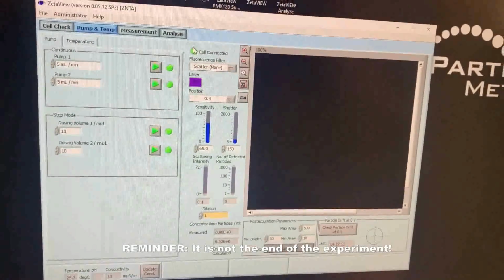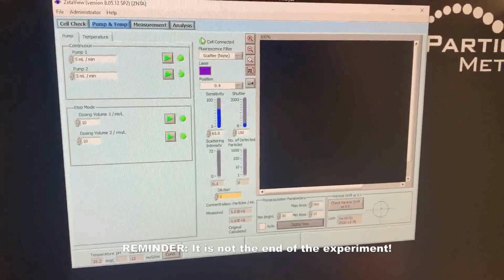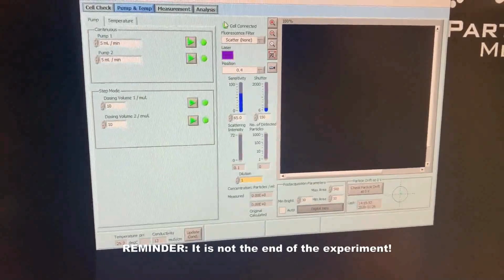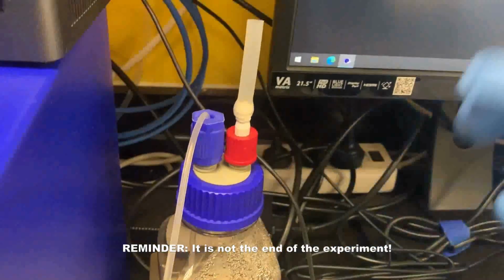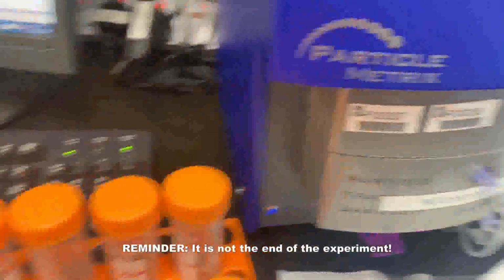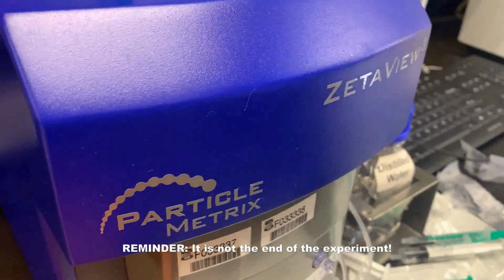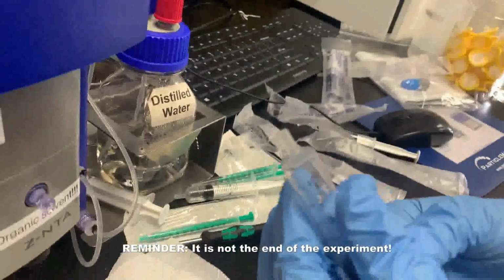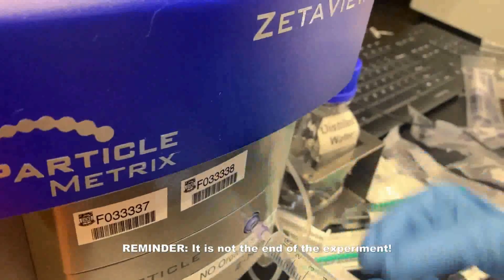Then the next step is to inject 5 mL or more of dry air to make sure all the liquid in the cell is removed. And you have to make sure bubbles are generated into the waste bottle to make sure the cell is dry. So we also use the syringe with just the air. Inject here.